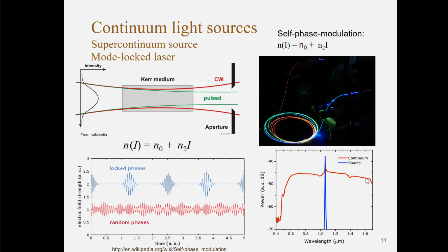You might say, hang on, you just said that many modes are lasing inside this laser cavity, so that means it's actually not continuous. And this is true. You actually have laser modes, and typically they're separated by between 50 megahertz and a gigahertz or so. But for many spectral applications, not all, but many optical spectroscopy setups, you don't consider these because they're so close together that you can just use it as if it was a continuous light source.